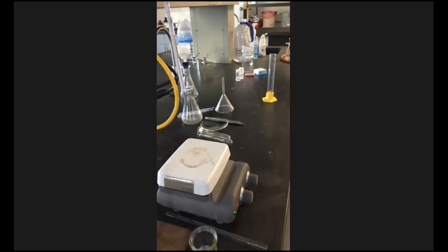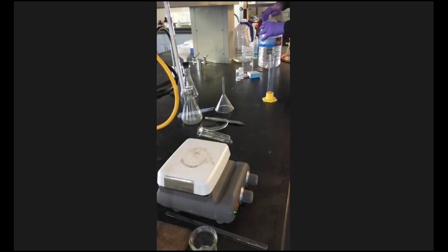We need a 400 ml beaker filled up with deionized water. And the acidity of the water and all that stuff has already been tested, so we're not going to do that step. We don't need that step. All right, but I'll do the pH just so you'll be able to see that I'm not lying to you.